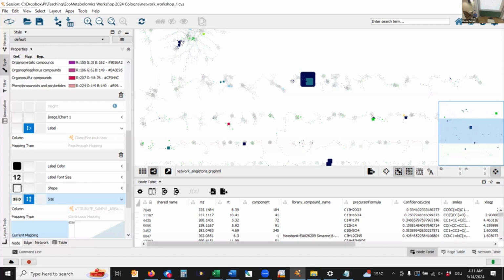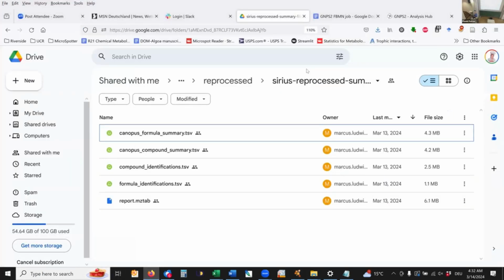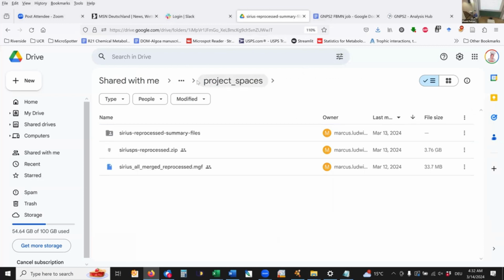Initially, you remember, there's this long data frame that Steffen generated with you. So we have all the information. The only thing we technically would need to do is sum this up manually and then add it to it.